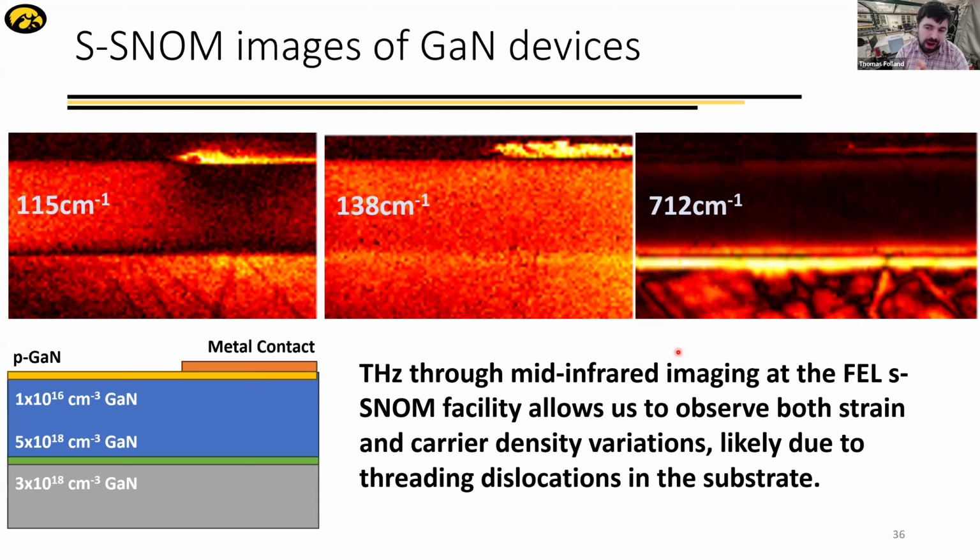Especially when you get into things like moiré effects, it's hard to predict if you will see them. I will say at this point, our understanding of the strength of interaction, and especially the sensitivity of techniques like SNOM to see small changes, is still developing, because SNOM is relatively new. But you can see a lot of interesting effects. A lot of the time we can just explain it with Fresnel equations and Maxwell's equations, but you also see more interesting material effects.